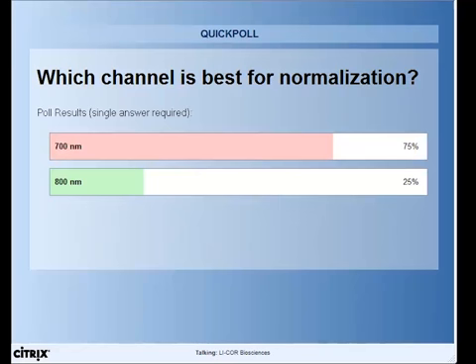Looks like we're getting a lot of good answers. Now, of the two options, what I'm looking for here is I would choose to normalize in the 700 channel, or the 700 nanometer channel.